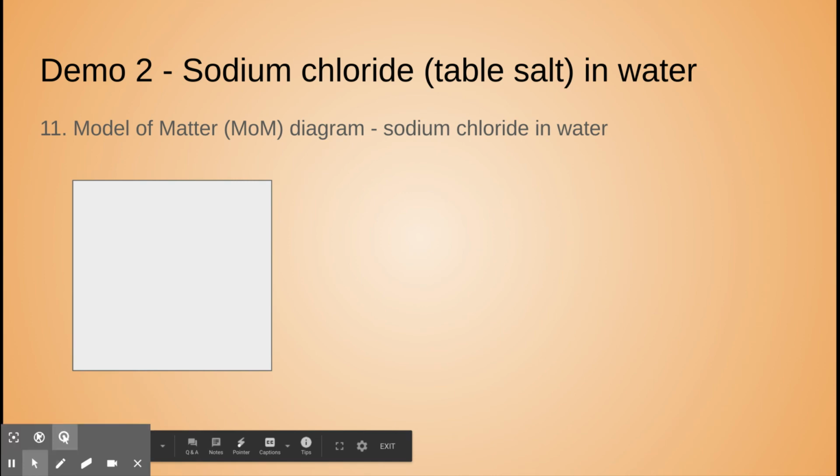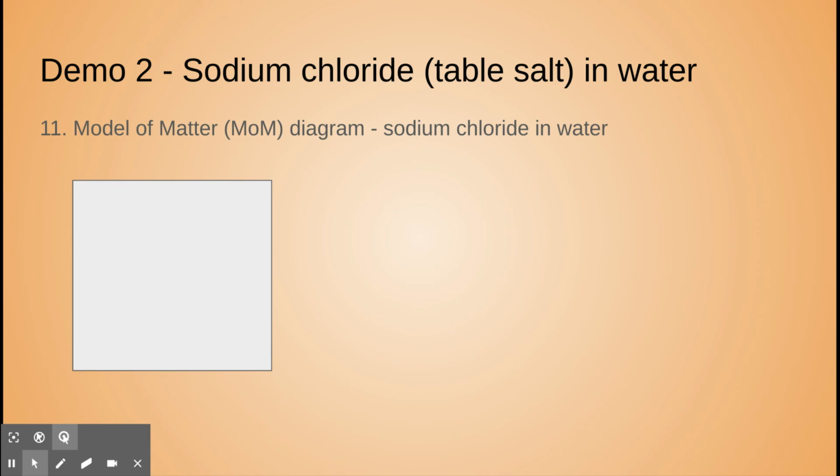All right, so here's how we dissolve. Usually we're able to have a conversation about what happens when something dissolves, because sometimes students think that it just goes away. But if you look at your starting mass up there in number 3 and your ending mass in number 9, it's the same mass. The salt is still there. All the water is still there, and nothing else really happened. I did not have a color change. The temperature stayed the same, which would be another indicator of a chemical reaction going on. So that stays the same.